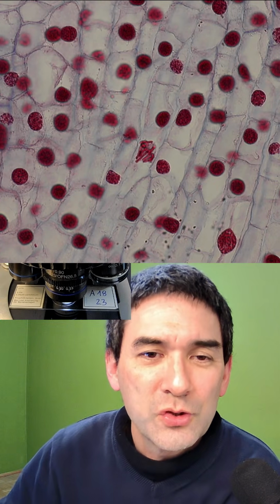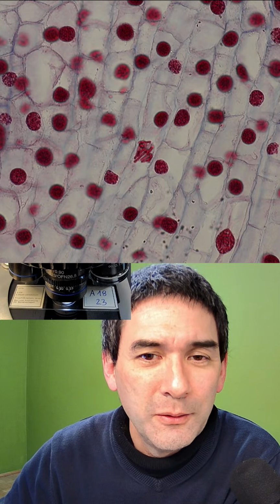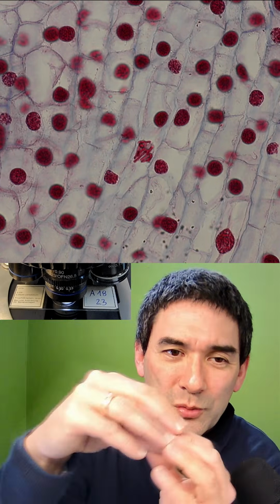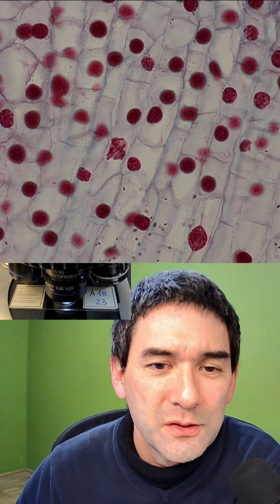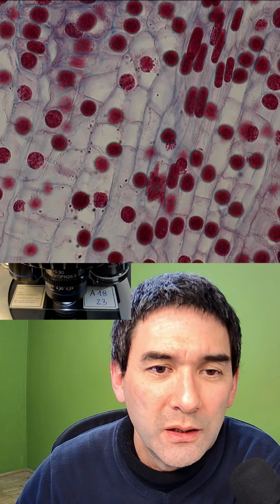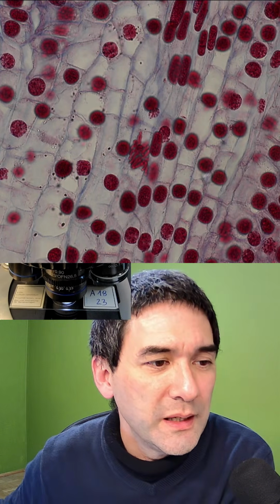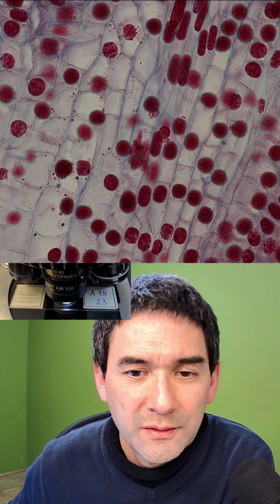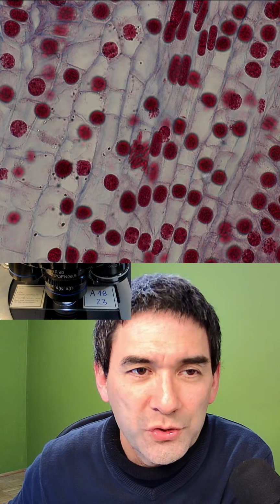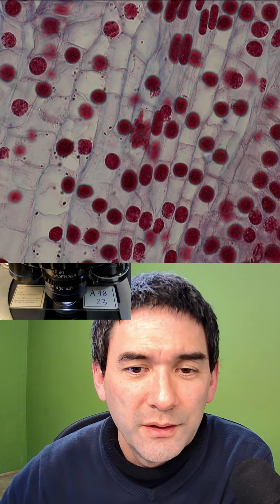It's weird long structures. Well, these are of course chromosomes. This is a dividing cell, right in the middle right now. Those long structures, these are chromosomes. So there are a few of those over here right now in the center as well. You know what? Here I'm going to show you again. Yeah, these are also chromosomes over here. So I'm going to show you another one.